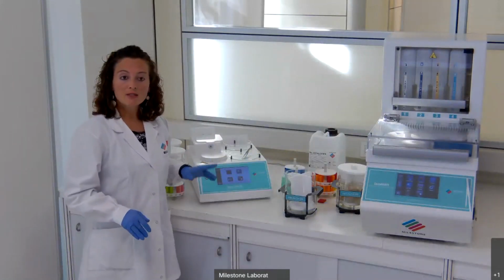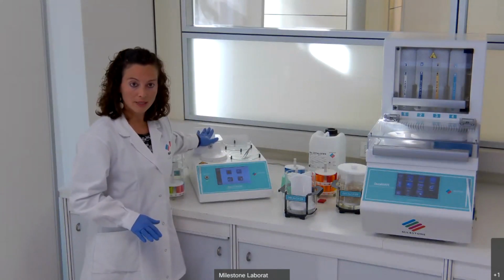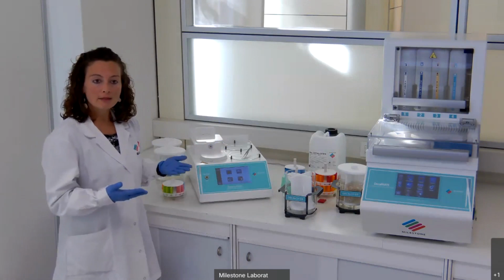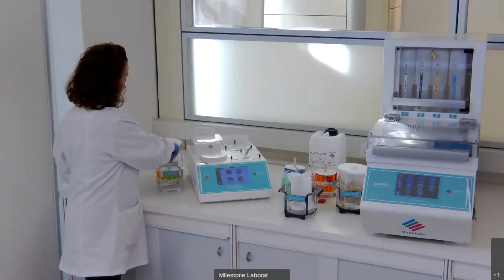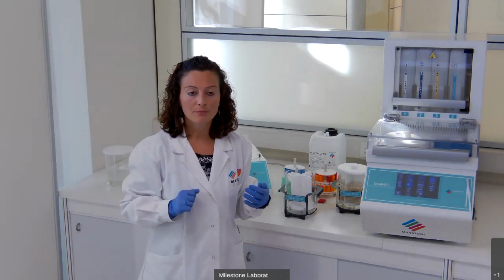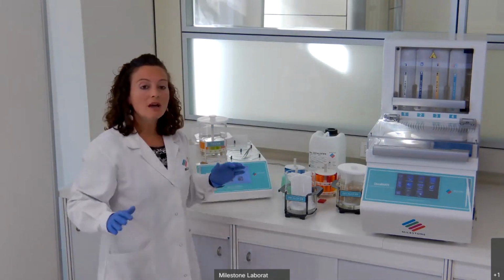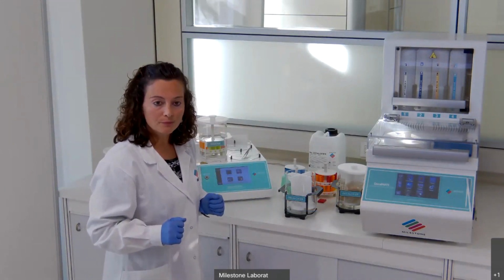The bone station unit has 2 main working positions: a back position only with stirring without heating, and a front position with stirring and heating. The ideal use of the bone station is to collect the specimens during the day in the back position inside the fixative. The specimens will be kept in fixative with stirring. When all the specimens have been collected, we can move the fixation module to the front position to complete our fixation with time and temperature. For example, 1 hour at 37 degrees.